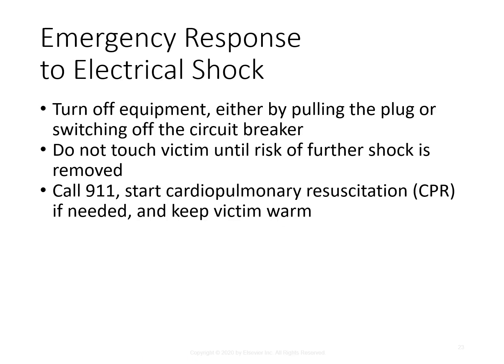Emergency response to electrical shock. If an electrical shock does occur, you're going to want to turn off the equipment, either by pulling the plug or switching off the circuit breaker. Do not touch the victim until the risk of further shock is removed. You're going to call 911 and start CPR if needed, and try to keep the victim warm. If you cannot turn off the electricity, you're going to break contact between the source and the victim using a non-conductive material like a wooden broom handle. Electric shock can also cause tissue burns. Tissue burns caused by electricity can be extensive, with extremities being the most vulnerable.